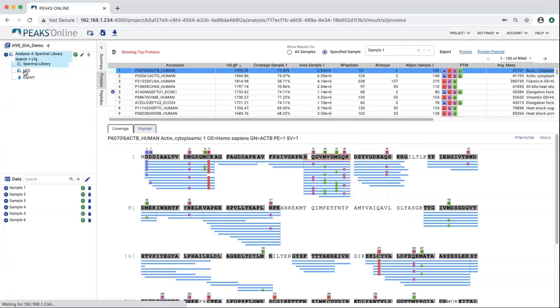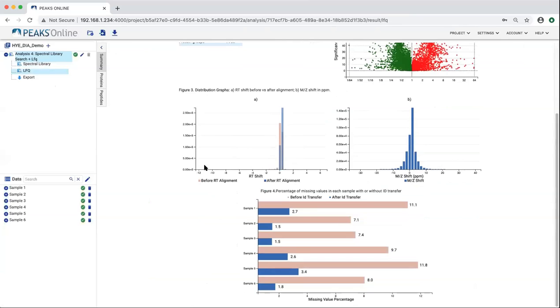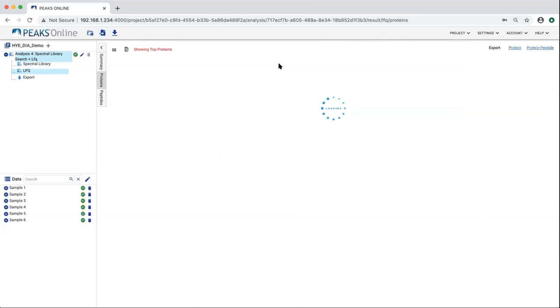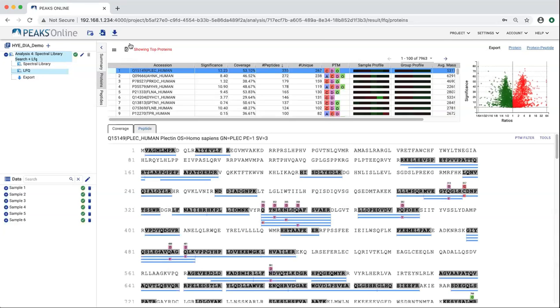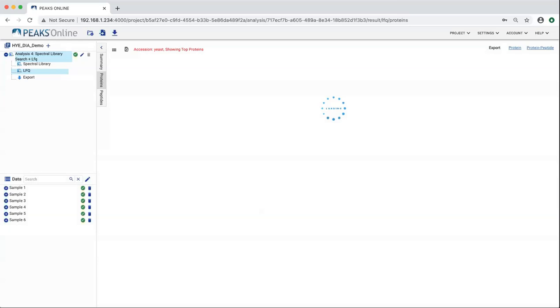And so all that's really put to use when you come to the label-free quantitation. And just like DDA, you get match between runs in the same manner. And if you look at your proteins, again, what we see are expected changes. So if we sort by the more abundant to the less abundant, you can click on that by peptides, and we can come here and show yeast.